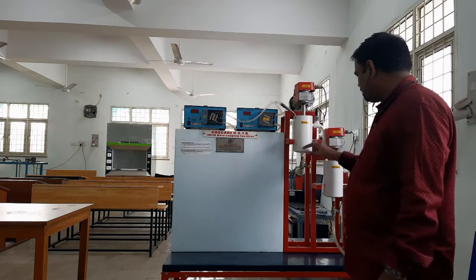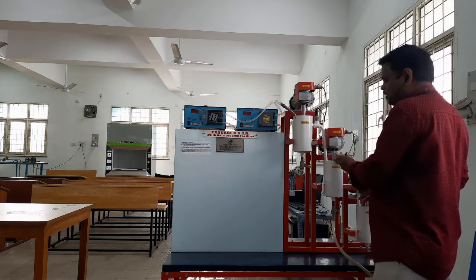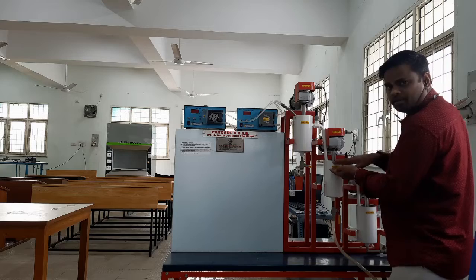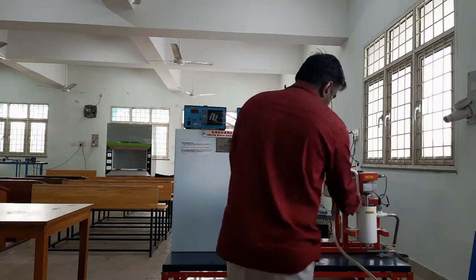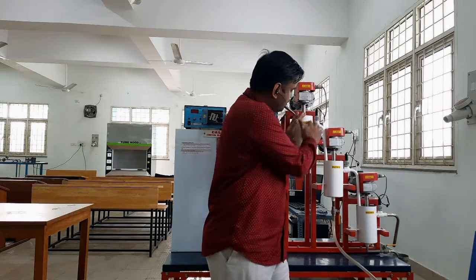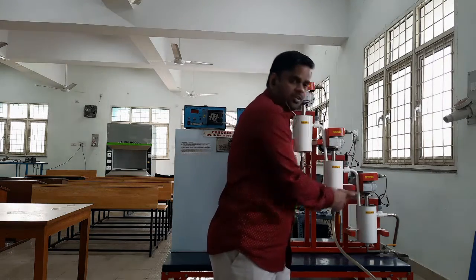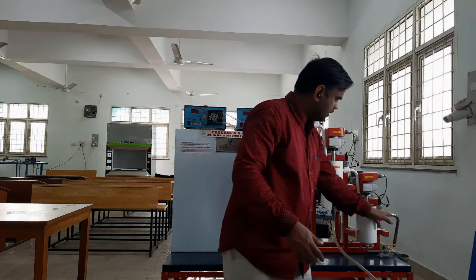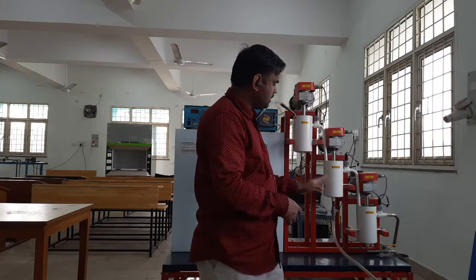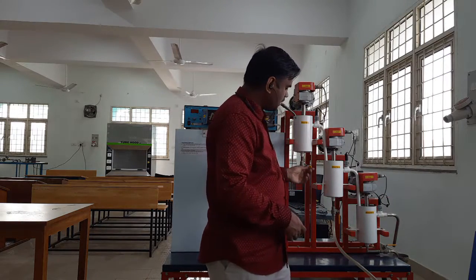Once the steady state is attained, once the level comes to here, the fluid will flow into the second reactor. The same thing happens in the second reactor: it will get filled up to here, then the product stream will leave into the third reactor as the feed. So the exit stream, the product stream from reactor 1, is sent as the feed to the second reactor, and the product stream from the second reactor is sent as the feed to the third reactor. We have the exit at the third reactor. This is the experimental setup, where we have 3 cylindrical columns with 3 valves at the bottom for discarding the solution or collecting the samples.